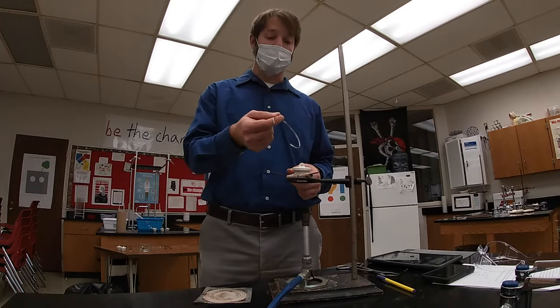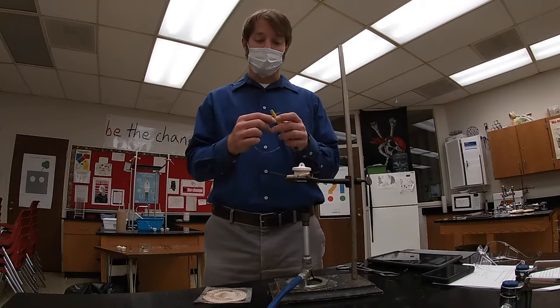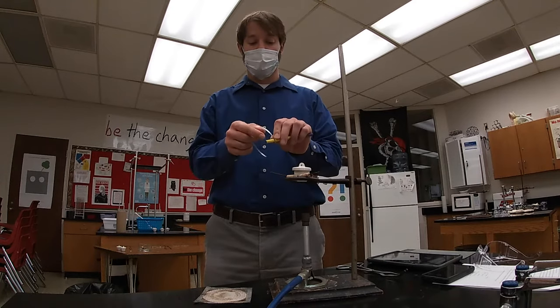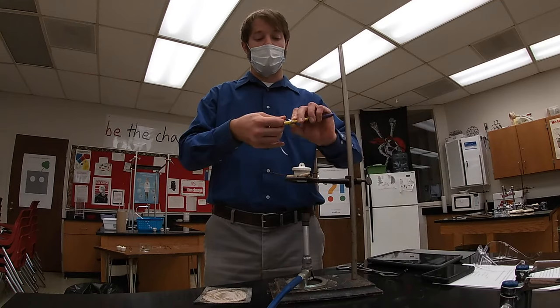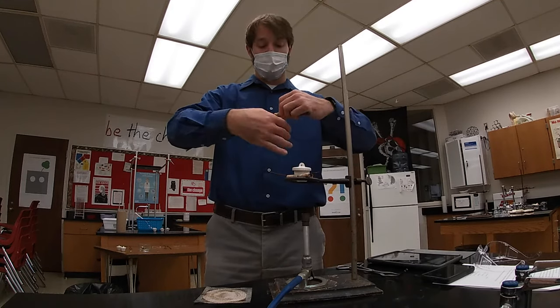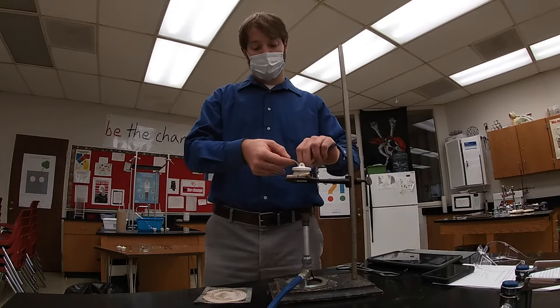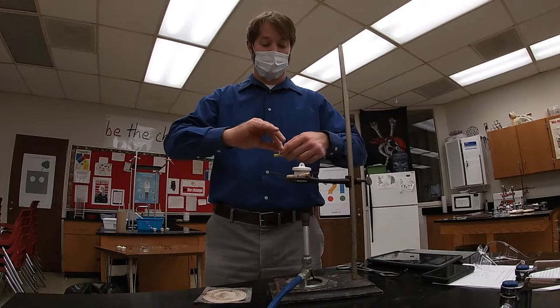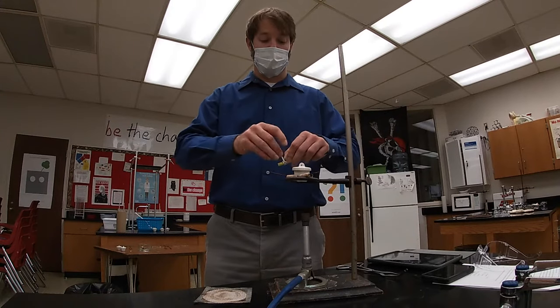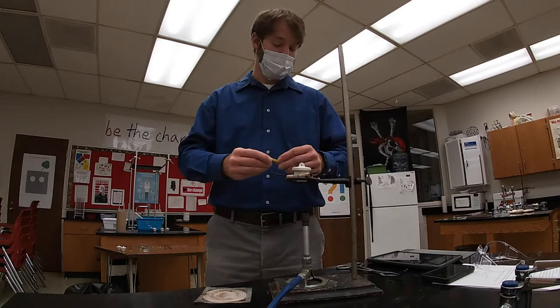The first step is to get the magnesium into the crucible. To do this, I'm just going to coil it around a pen. I've got to be very careful when I'm doing this because the edges of the magnesium are sharp and I don't want to cut myself. No need to be fancy — just get it in a tight formation so that it's going to fit nicely into the crucible.